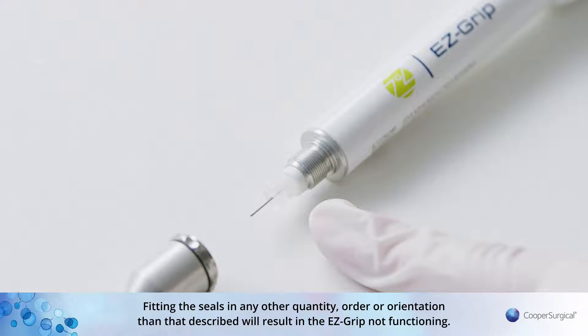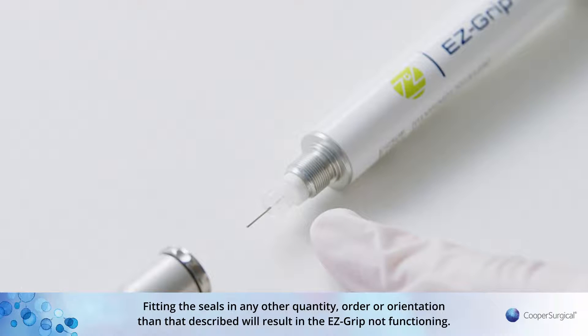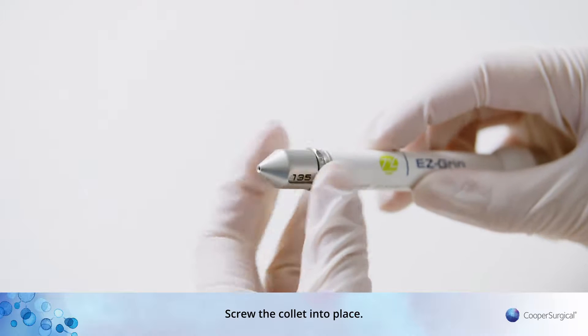Fitting the seals in any other quantity, order, or orientation than that described will result in the EZ-Grip not functioning. Screw the collet into place.